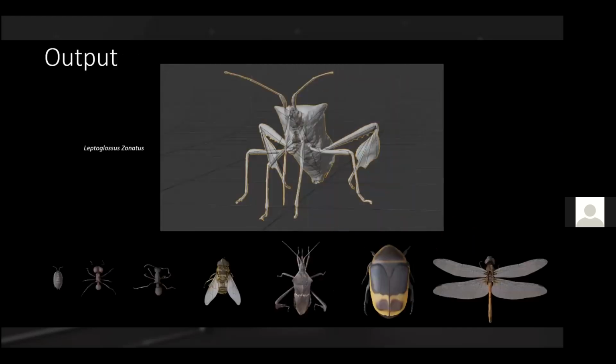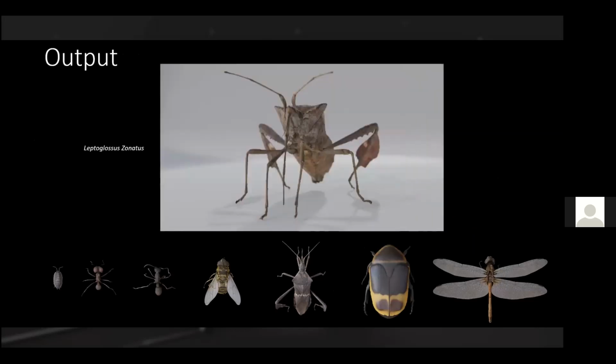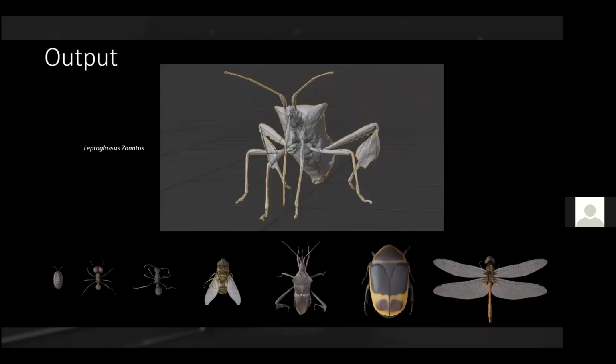Okay, you then have image processing, and you then take these images and feed them into the photogrammetry software of your choice. We're not going to talk about this because this is not a contribution that we really make. We worked a lot with Meshroom because we like working with open source software, but other software is available and can be used with these images.